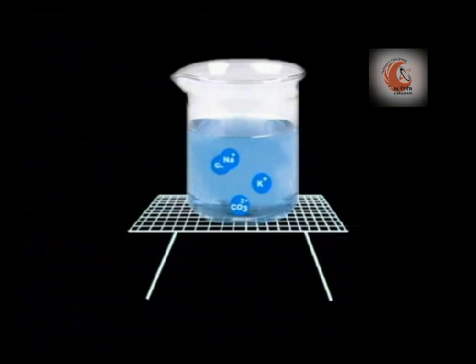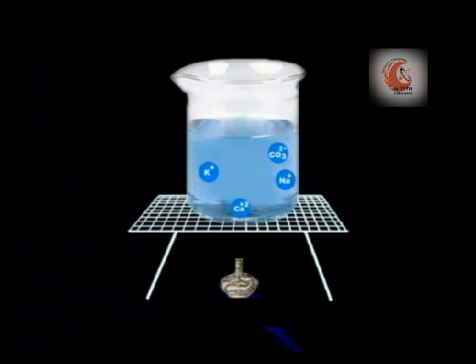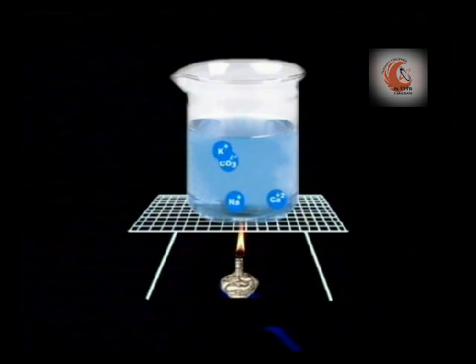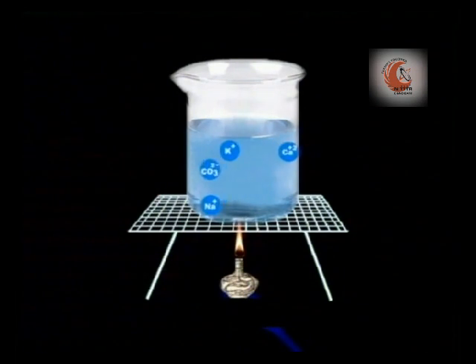The conductivity of a sample is also dependent on temperature. With the increase in temperature, the activity of ions will increase and so will the conductivity value. So, therefore, the standard temperature of measurement, which is 25 degrees centigrade, should be used for measurement.